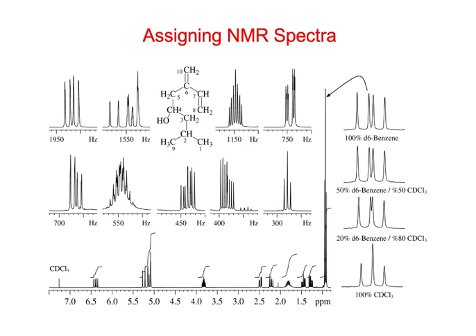So I think if we just want to do the assignments, notice the way it is here, that the spectrum's pretty small at the bottom, but then it goes, this is a higher frequency range, right? And then it goes down. And so they have these in frequencies. So it goes this way and then this way. Okay, so the highest frequency here would be the highest chemical shift down here. Right? And then we have this stuff here, and we just keep moving down like that. Okay, so here's a molecule. You can see that okay.